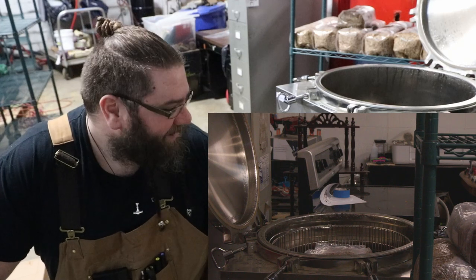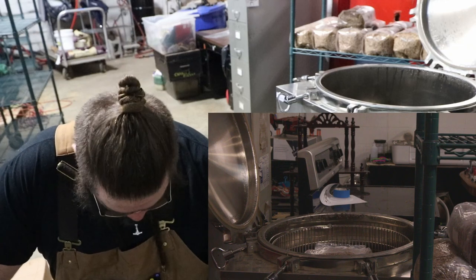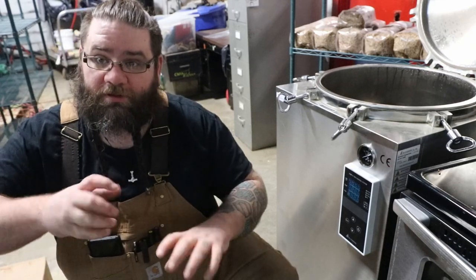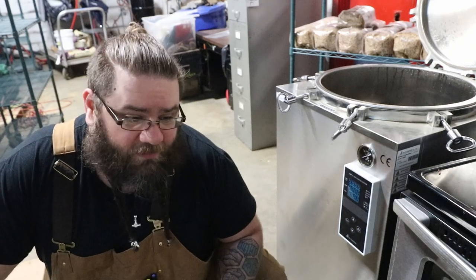That said, it's very easy for that, when it bleeds off that pressure, for your agar to boil out. So I have been able to do agar in those media bottles that actually close up really well. But as far as doing an Erlenmeyer flask, I have not had a single successful run. So not the best thing if you're trying to do agar.